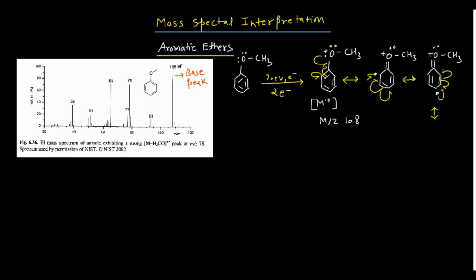So what would be your next structure, guys? Say this is my system. Now this bond is here and this one is here. Now this is the electron which is present here. This is double bond oxygen, CH3, one pair of electrons and a positive charge. And finally, you can return to the original position. The only difference between those two structures would be the shifting of the double bond, right?